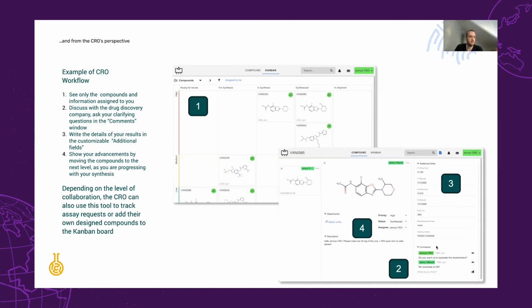So we hope that with this system, if you should generate hundreds of compounds with possibly advantageous permeability and possibly great potency, you can easily access external synthesis CROs and benefit from a highly efficient system to keep track of all of this.